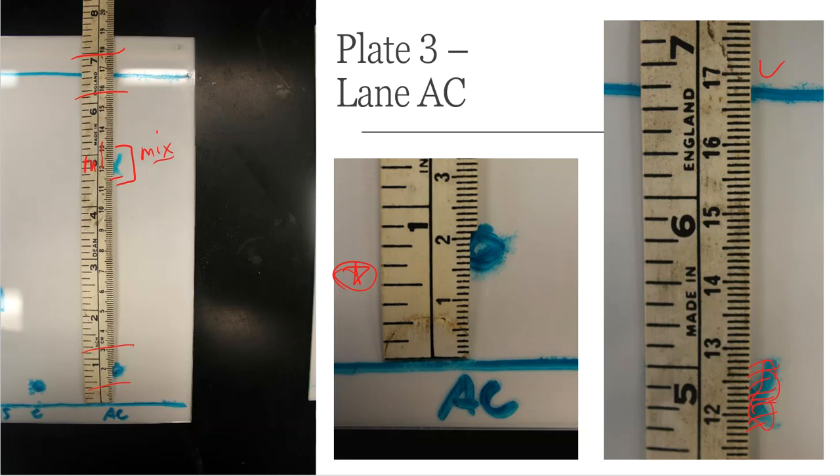All right, so we have just done this TLC plate lab together. That's really all that you need as far as data goes. So you'll calculate the Rfs for each of these components on each of the plates. You'll pick the plate that's the best out of the three. And then the lab directions will want you to calculate the Rfs for all the spots on that plate. It wants you to ignore the other two that you don't use. So there you go. There's all of your measurements. There's all of your readouts. If you do decide to use whichever one you need to use as far as the best separation goes, you have the measurements for that particular plate.